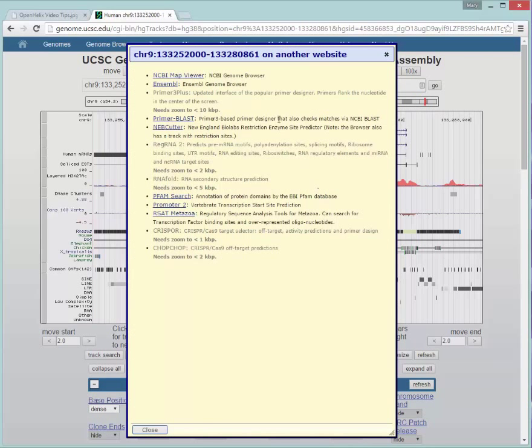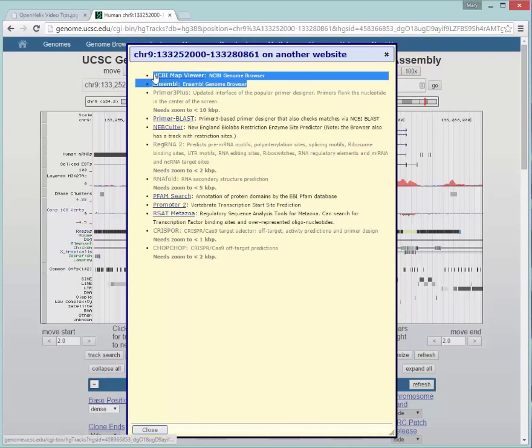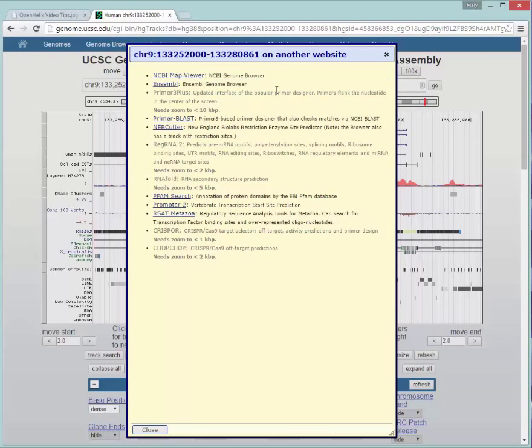So some of the tools were available before. You can see here you could send this same region over to look at them in the NCBI Map Viewer or the Ensemble Genome Browser as well. In addition, now there are a lot of other tools that you might find useful. You can design primers here. You can look at restriction enzyme cutting. You can look at protein domains. You can look for CRISPR targets.